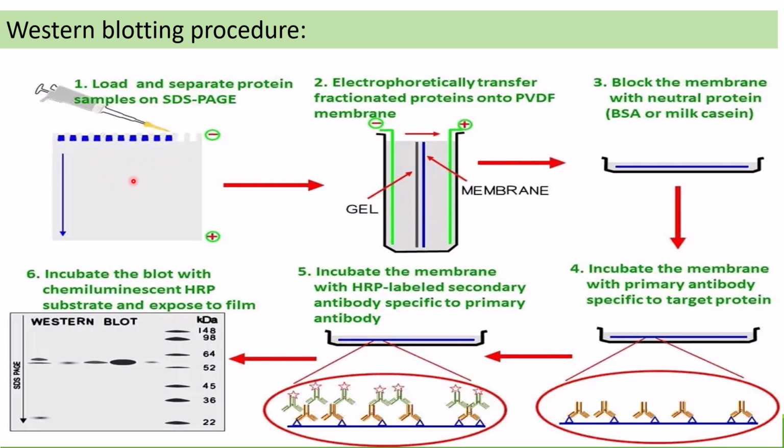The ones with the higher molecular weight will reside here. The proteins with smaller molecules will move like this. They will move faster. How? This gel has a certain mesh. When electricity is passing through it, the proteins will pass like this. The major principle is that the proteins stay on the basis of their molecular weight.